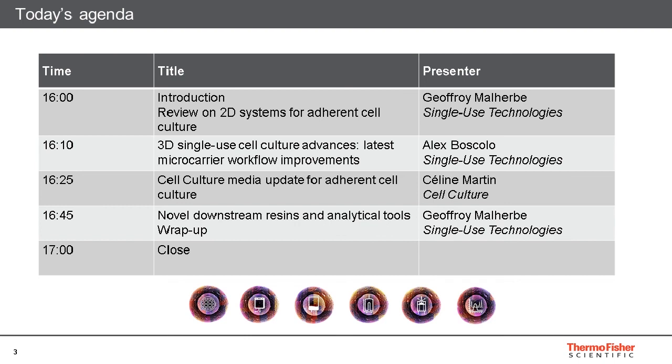So today, in this introduction, I'll provide you in the next 5 minutes a quick review on the two-dimensional systems for adherent cell culture, with a little bit of news in that space, but relatively mature technology. After that, we're going to have a more in-depth technical presentation by Alex Boscolo about the move to 3D cell culture for adherent cell systems.